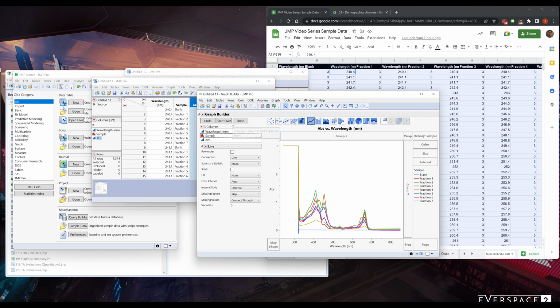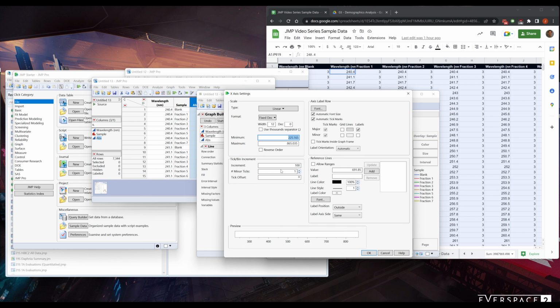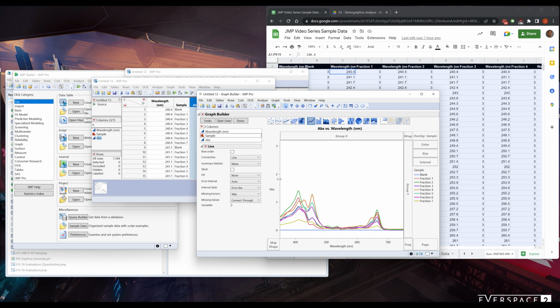All right, so now we have our spectroscopy data. We want to make use of the space. So clearly, this is the interesting part of the spectra. This should take up most of our graph, if not all of it. What's happening here is we're using organic solvents in this situation, and they absorb ultraviolet light. So everything below 350 does not make sense. Also, they don't really absorb above 700 or 750. So we're going to change this axis to measure from 350 to 750. All right, okay, bam, there we go.